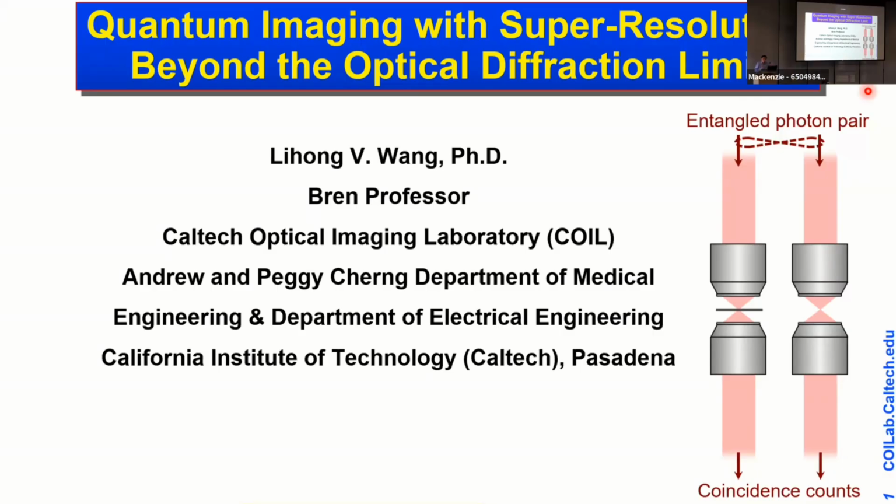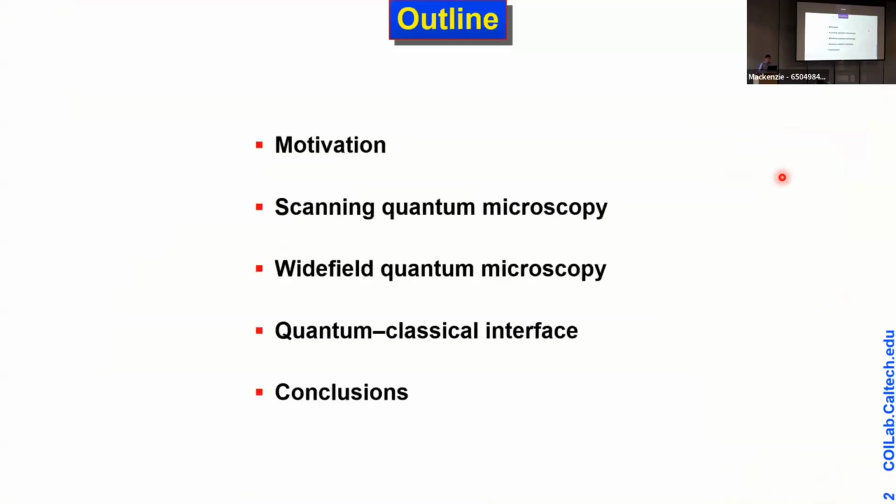Today I'll talk about quantum imaging with super resolution beyond the optical diffraction limit. I'll cover two main methods: scanning version and the wide field version of quantum microscopy. Now I'll talk about our recent work at the quantum classical interface.